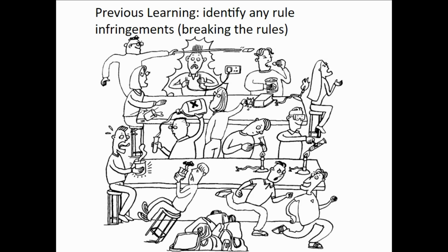On the next table, if we start on the left, we've got somebody sat down without goggles and they're touching a hot beaker. And to his right, you've got someone pouring chemicals above head height, also no goggles. You've got someone heating a test tube full of liquid of some description, looking down it with no goggles.